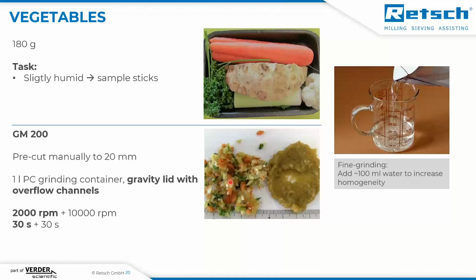Or you can reopen the container and mix it manually several times, but this is also annoying, so adding a little bit of water helps greatly. And here again, a fine and a coarse grinding step, each 30 seconds.